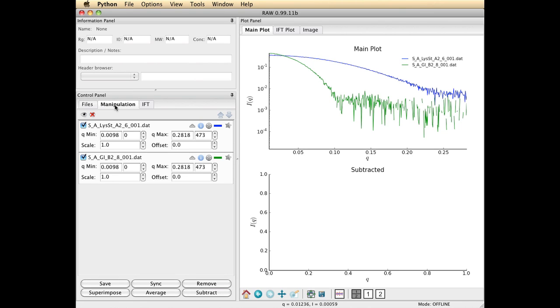The manipulation tab gives you a little block for every curve that you've loaded into memory. Those blocks have in them scale settings, where you want to start and stop plotting the curve and constant offsets and some other things.